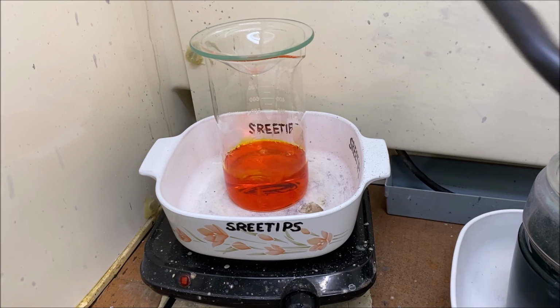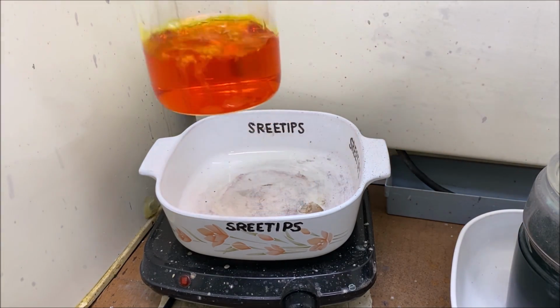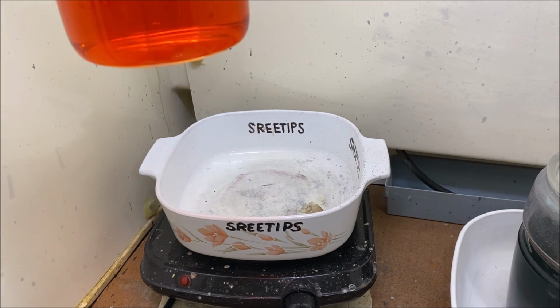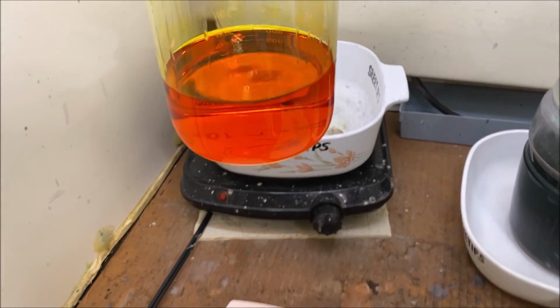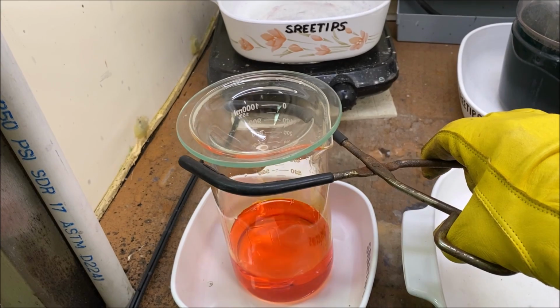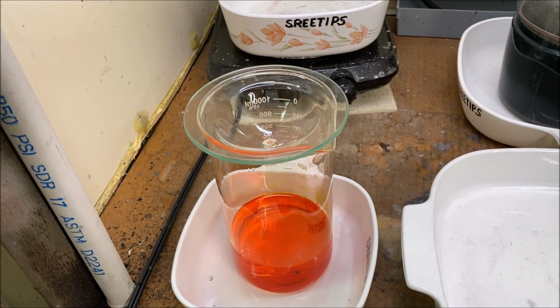Well, that took about 25 minutes. I think I see just a little bit, maybe not. I thought I saw a few granules of gold down there. That's okay. All the fumes have disappeared, and I think we've got just the exact right amount of nitric in there to just dissolve the gold.